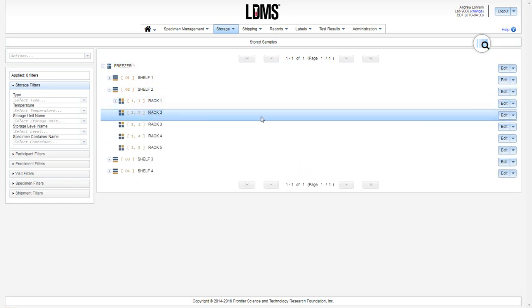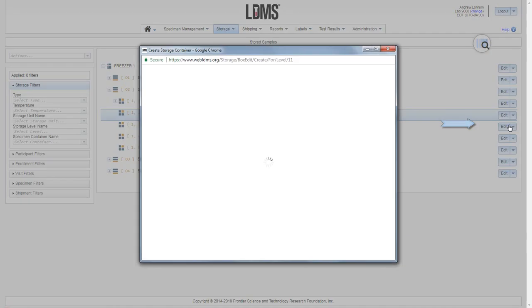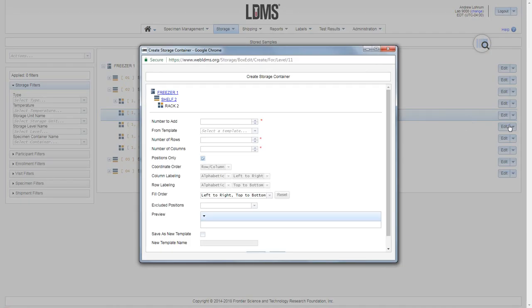We're going to use this rack and add a new container. You add a new container using the menu option over to the right, add new container. Click and you're presented with the create storage container menu.